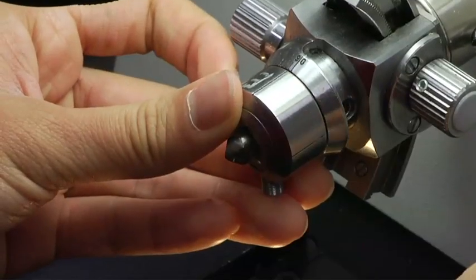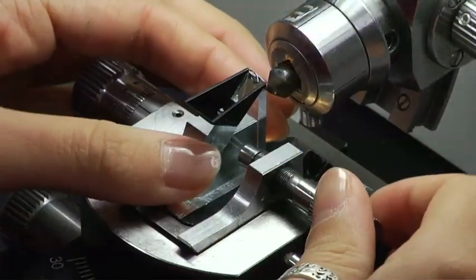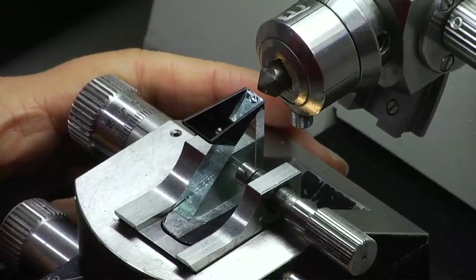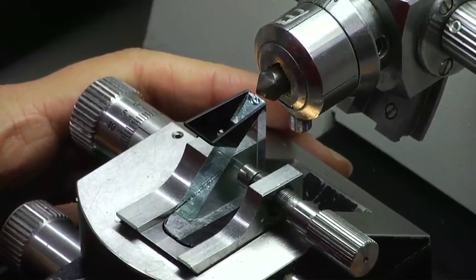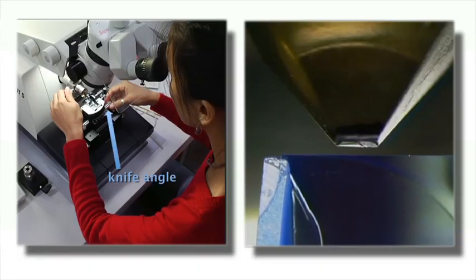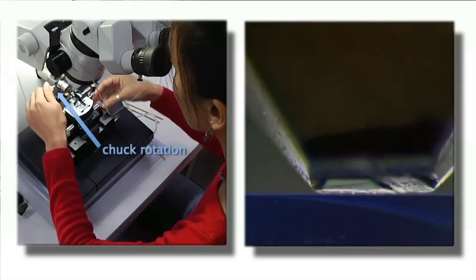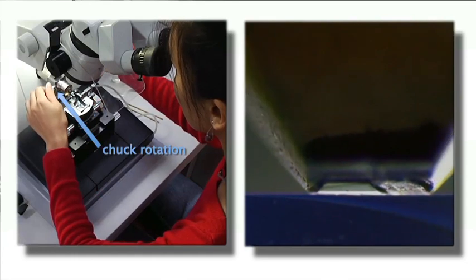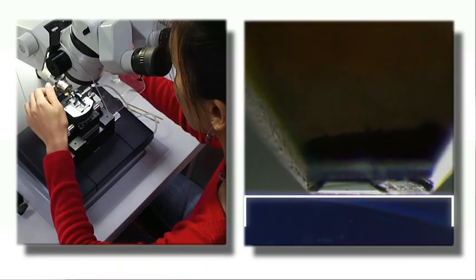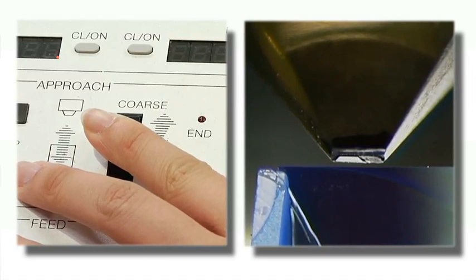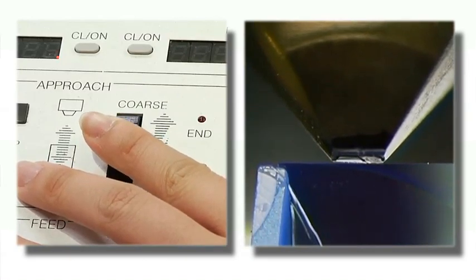Insert the trimmed block in the arm and secure in a boated knife. Coarsely approach the knife until the reflection appears on the block face. Adjusting the knife angle aligns the knife edge and the base, and adjusting the chuck rotation angle aligns the reflection. Align the knife and the block. The knife edge, the trapezoid base, and the reflection should be parallel to each other. Slowly advance the knife using the coarse advance control while checking that the alignment is still correct.